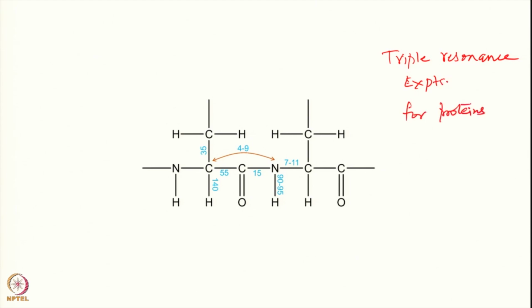In fact, this has been an extremely useful feedback system that multidimensional NMR experiments developed, but the proteins actually drove them very strongly. So, the desire to obtain structural information on proteins has been the motivation for developing new pulse sequences, and you will see therefore all these triple resonance experiments which we will describe are primarily directed towards proteins, and therefore we will be concentrating on that kind of a thing.